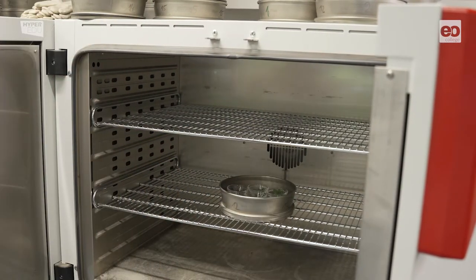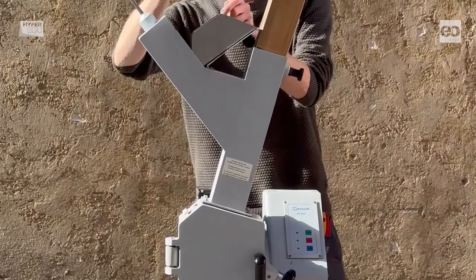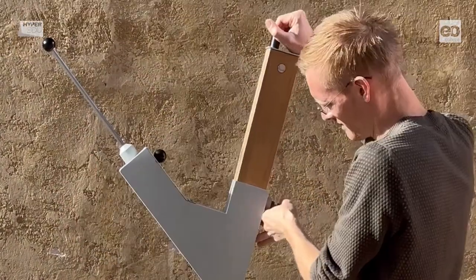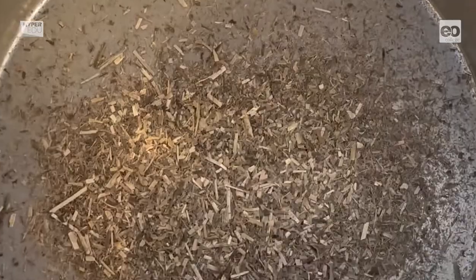After drying, leaf mass area can be calculated from the dry weight and leaf area. In addition, the dry samples are ground into fine powder using a laboratory mill. This powder is then analyzed for percentage carbon and nitrogen content via combustion in a special analyzer.